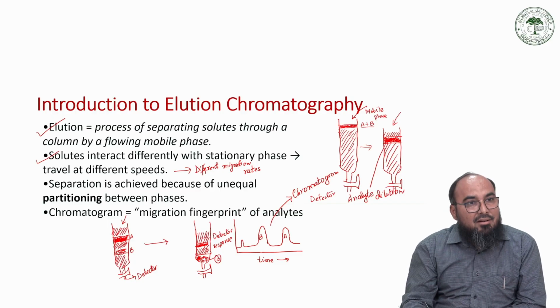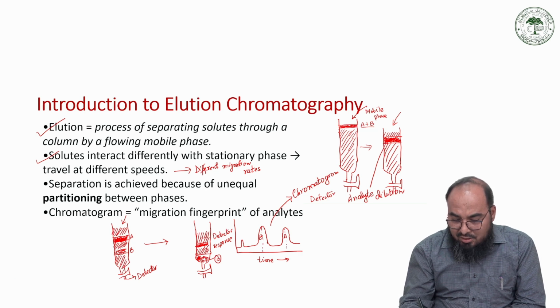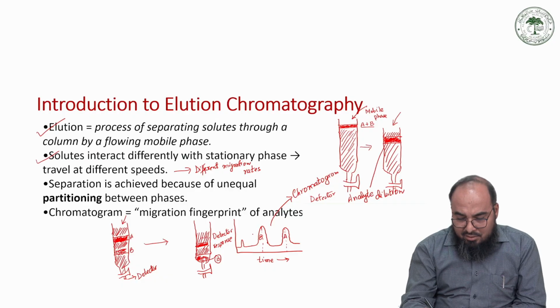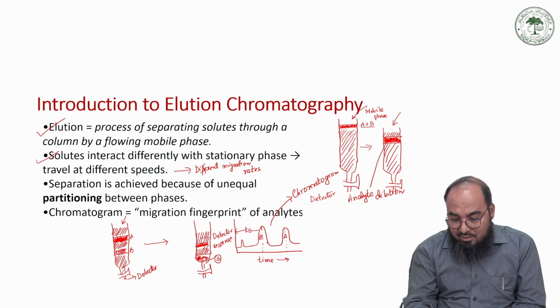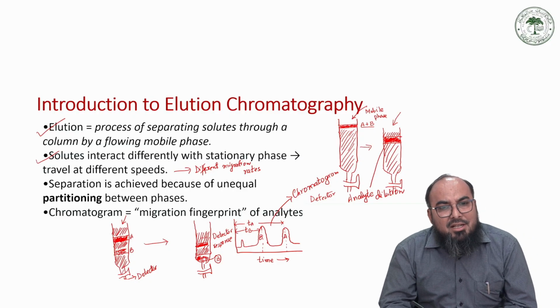As you can see here, if you draw a perpendicular, this is the time taken by B, you can say TB, while this is the time taken by A, TA. We are going to see this in terms of the retention times in our coming slides.